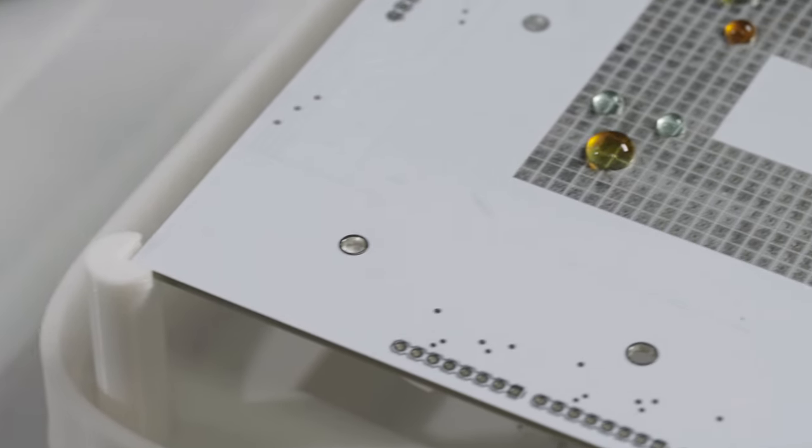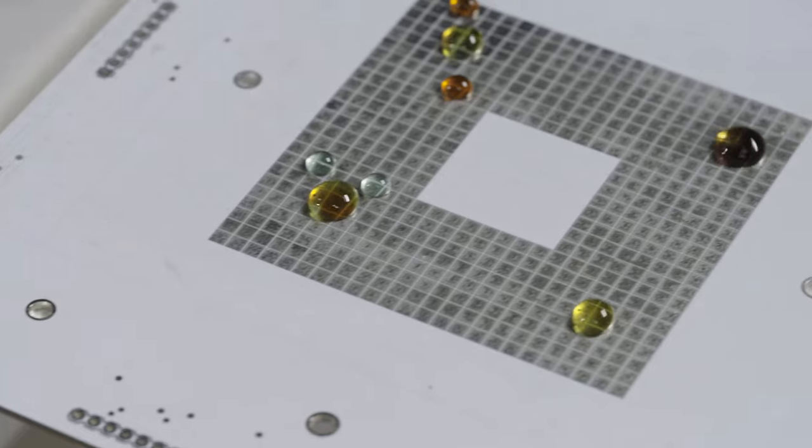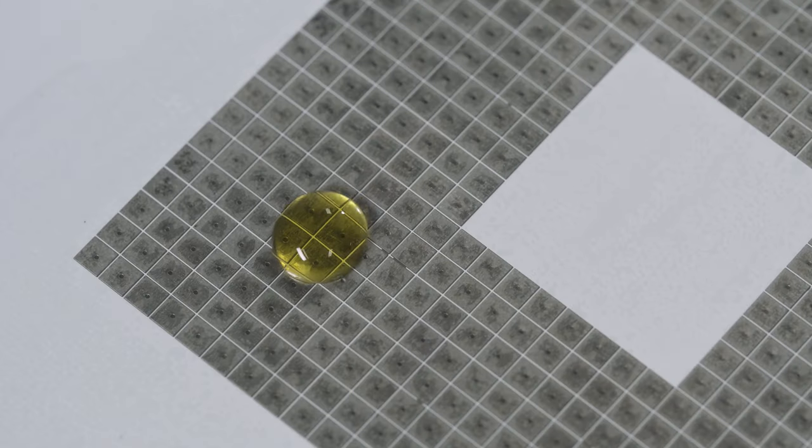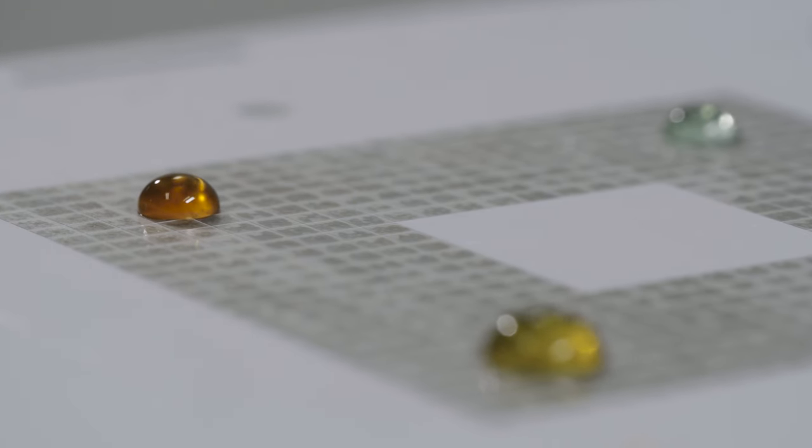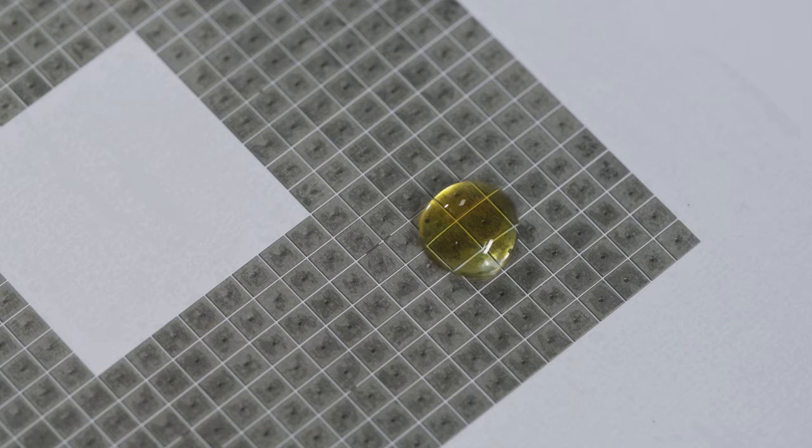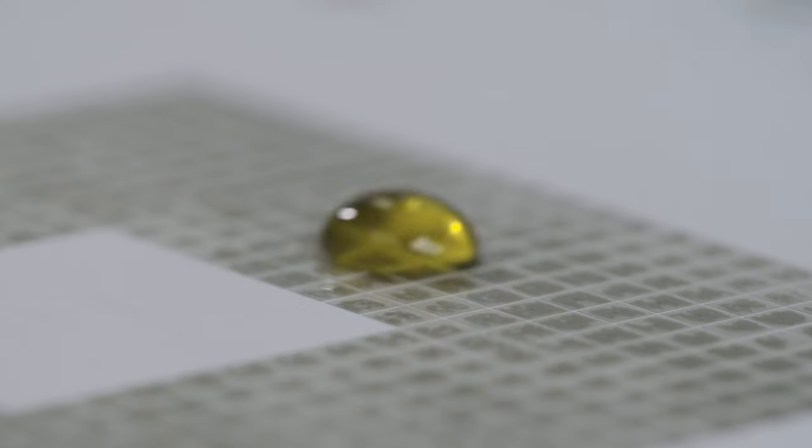So we have been developing a low cost lab-on-a-chip technology based on a physical principle called electrowetting, where we use electric fields to move, merge, stir, and analyze tiny biological samples.